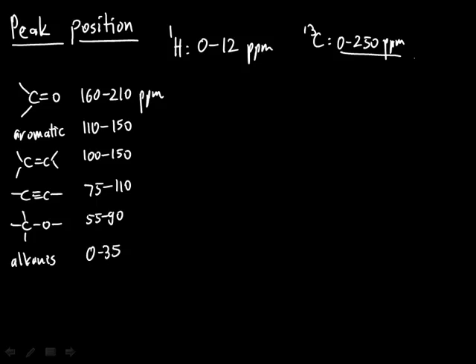So you can see that these correlate relatively well with corresponding proton absorptions, except that they are spread over a much larger range.